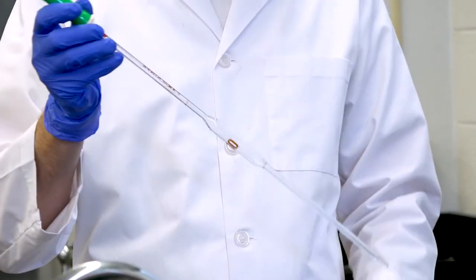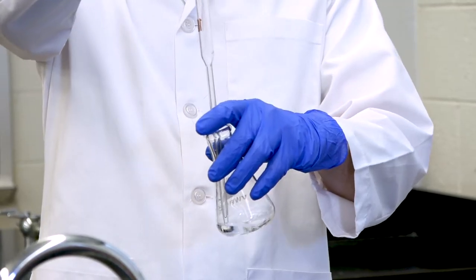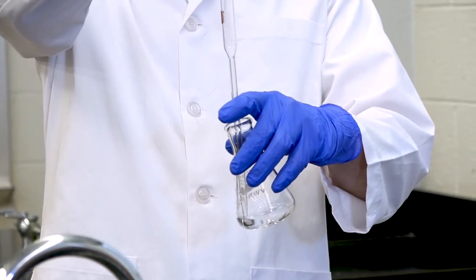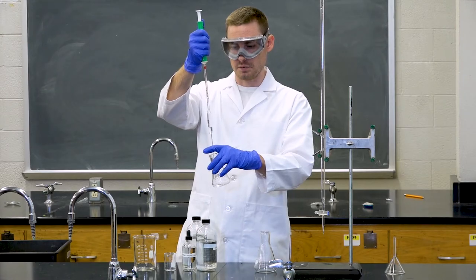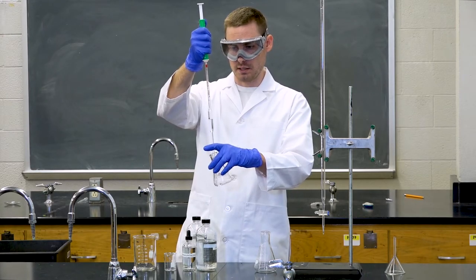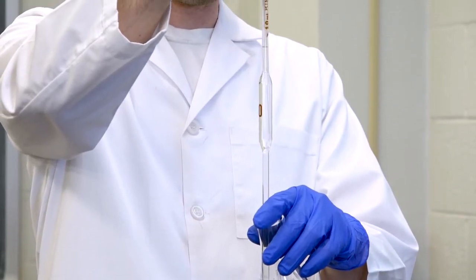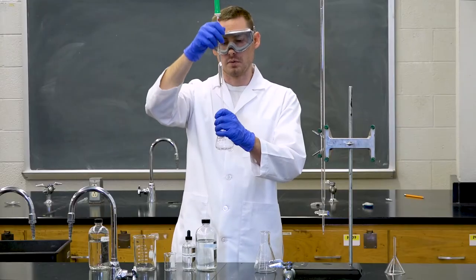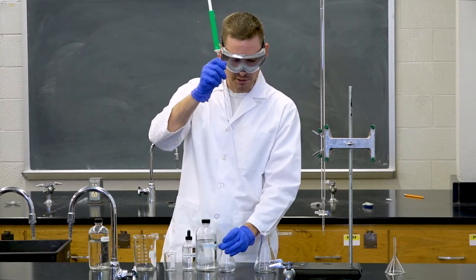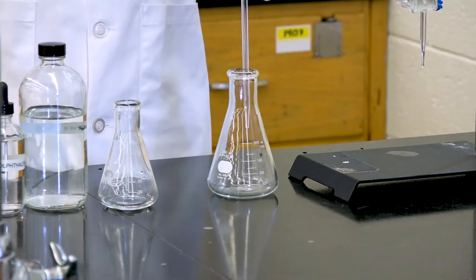Next, you can take your solution again and draw it up into the volumetric pipette using your pump until it reaches the small line that's above the bulb. On this pipette, it's about 1 inch above the end of that large diameter space. Once you have it even with the line, you then need to release it into an Erlenmeyer flask where the reaction will take place.